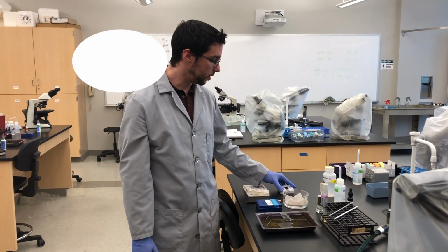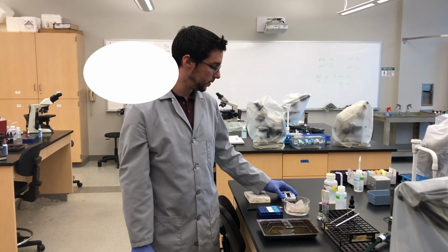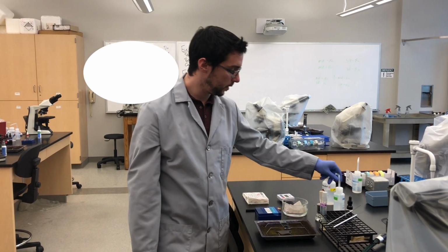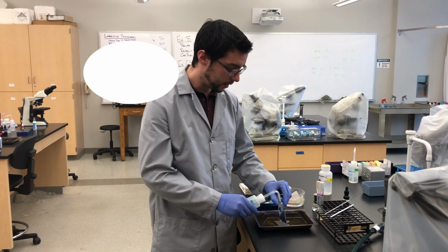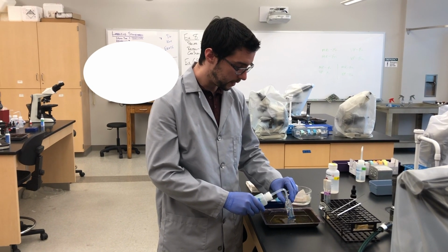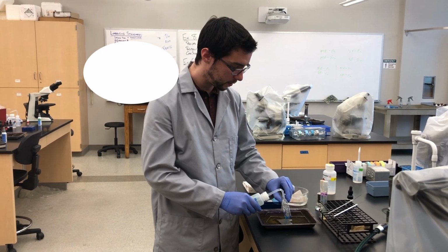So, once our minute is up, we will wash this off with water. There we go. Here's our water. Rinse it off just as before. Be very careful not to spray directly onto your smears so as to not knock the bacteria off with forceful spray.